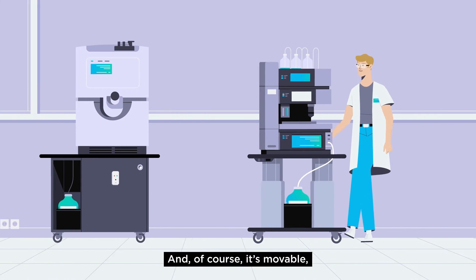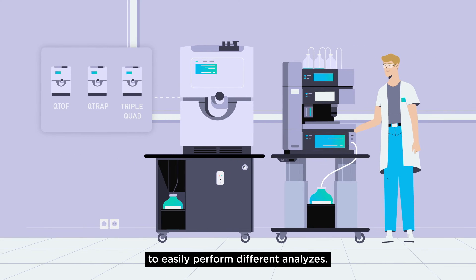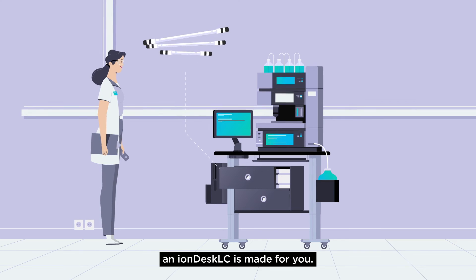And of course, it's moveable with lockable caster wheels to easily perform different analyses. If you are simply running a standalone LC, an IONDesk LC is made for you.